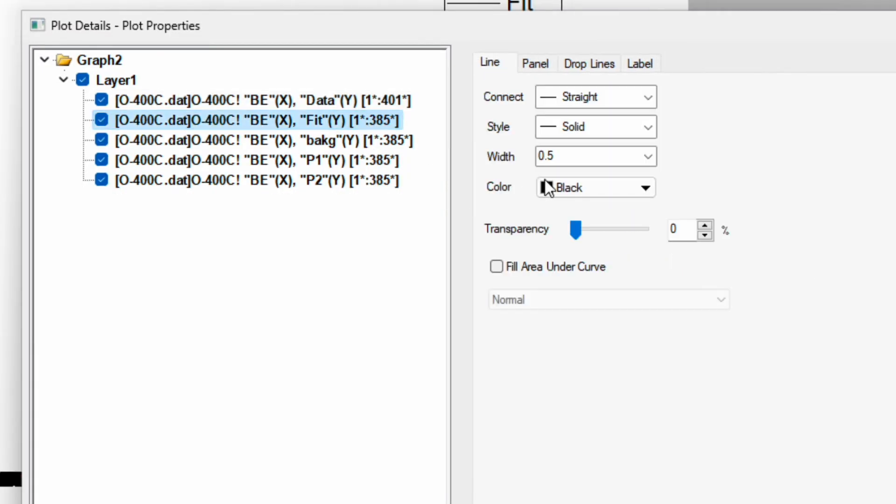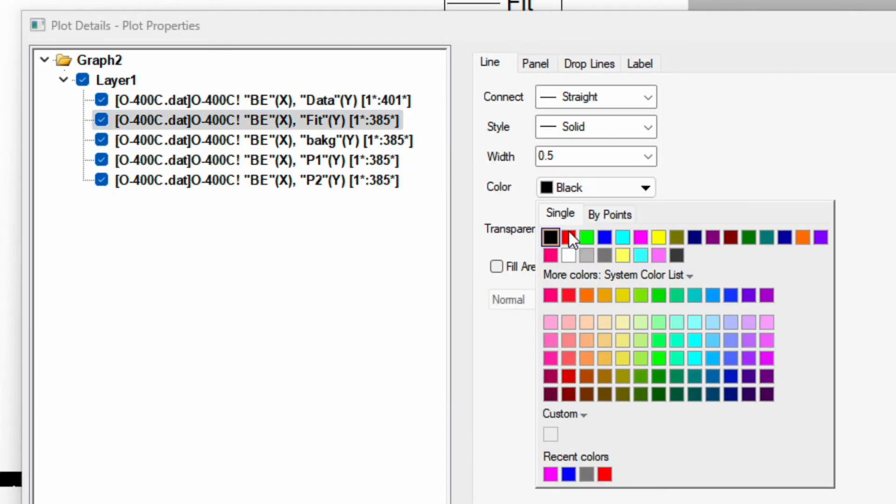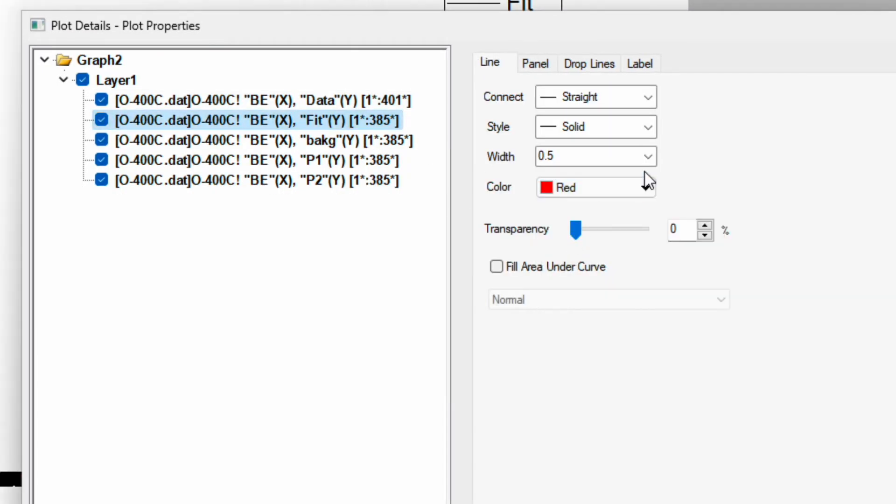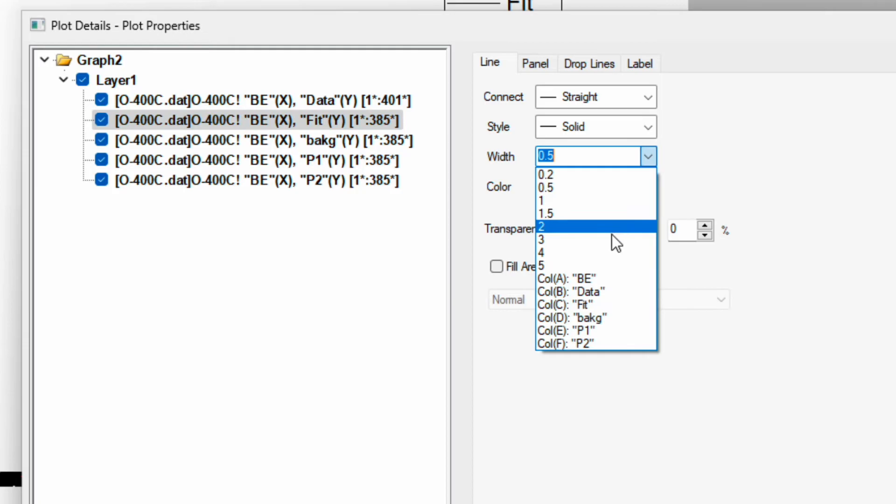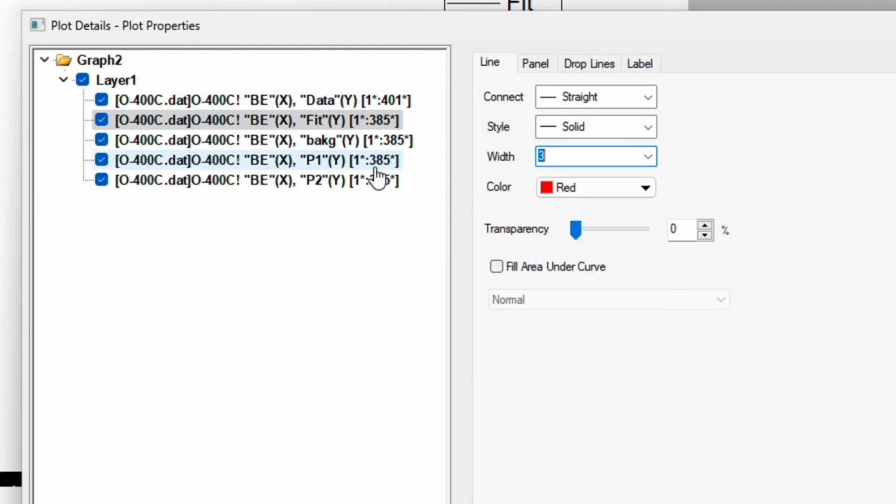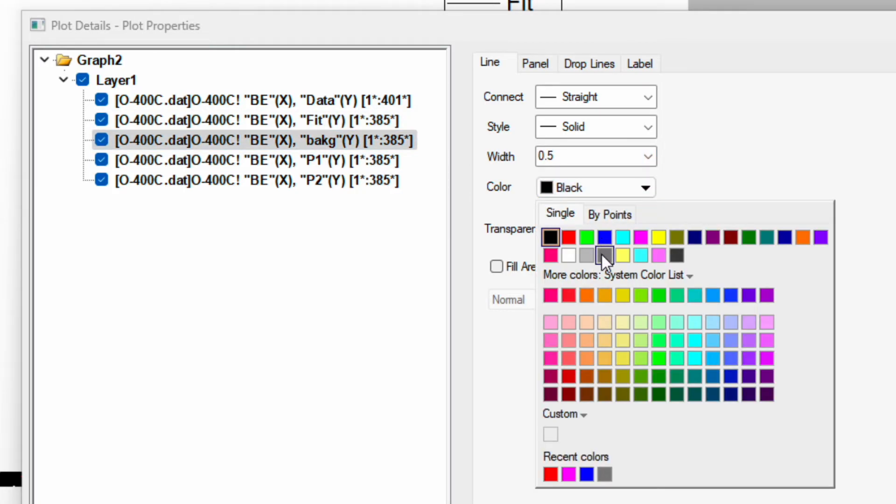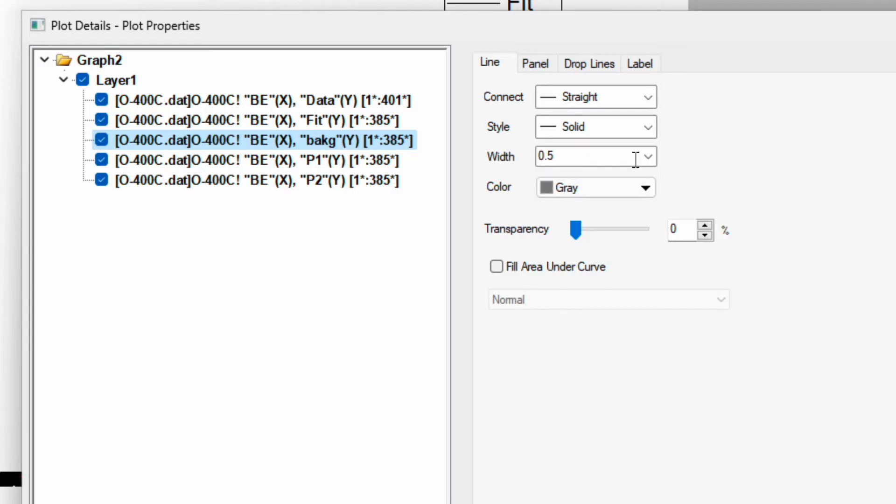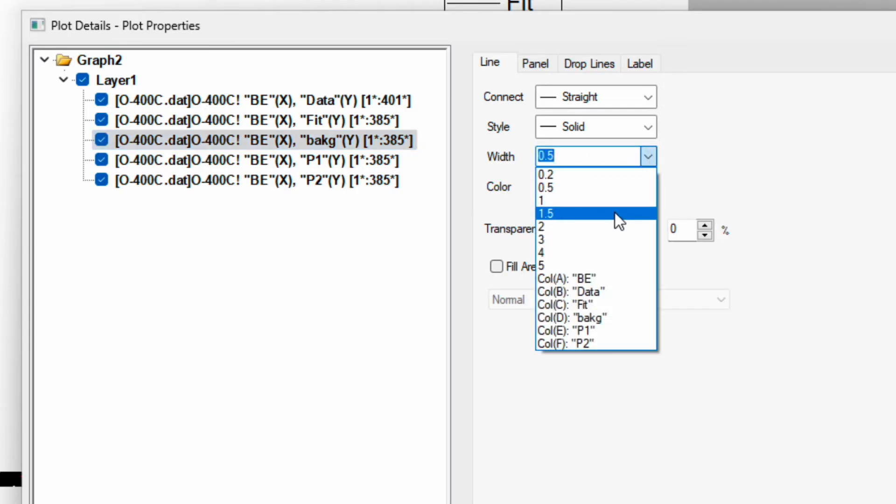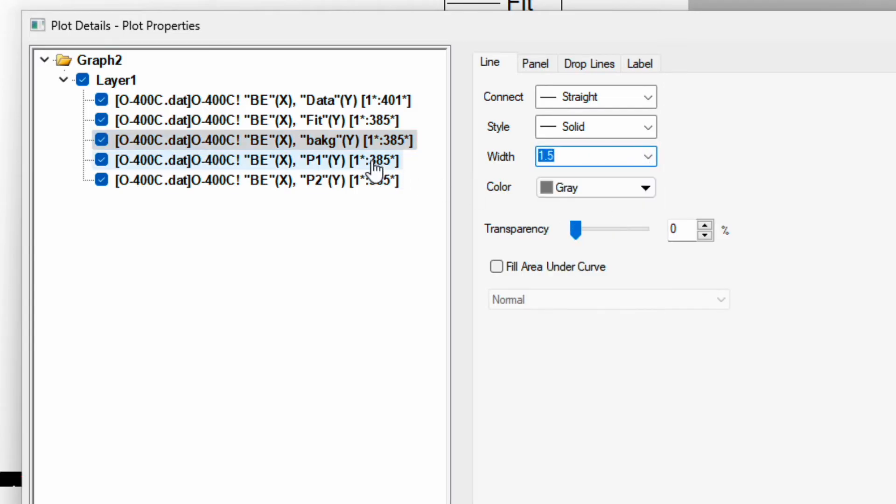Go to the fitting line, change this to red, and the width change to 3. Then go to the background, change color to dark gray color, and line to 1.5.